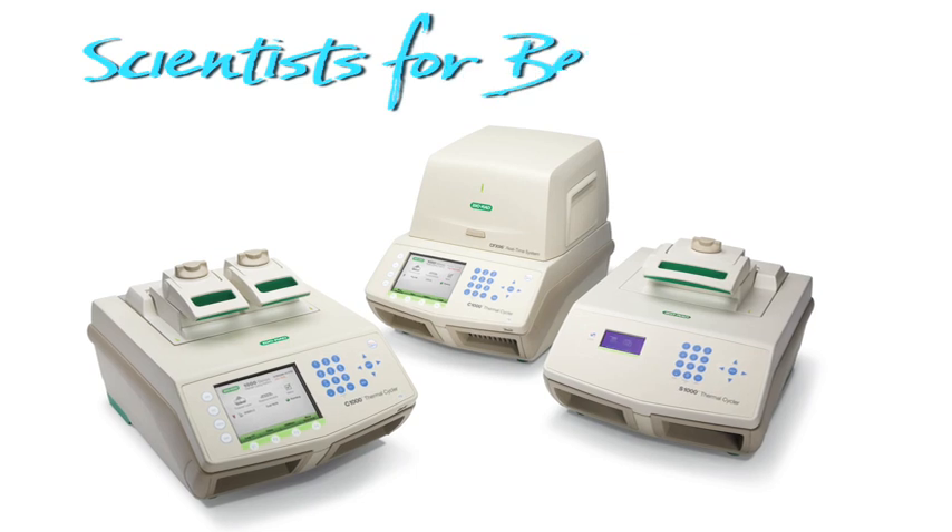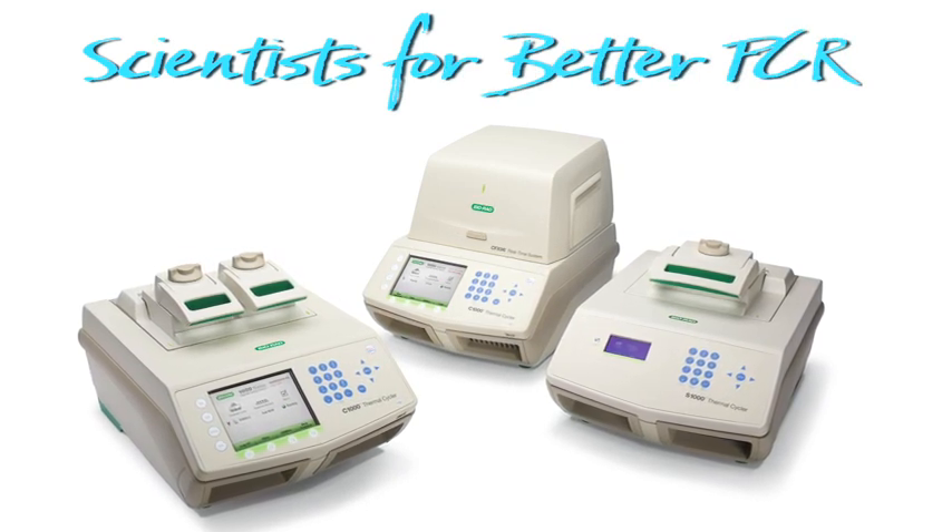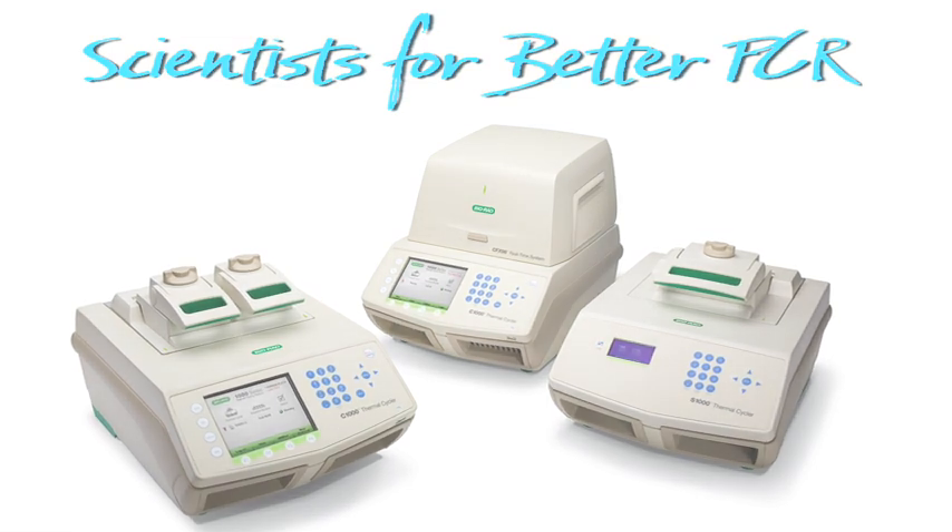PCR — to all the scientists out there doing PCR, Bio-Rad salutes you, with the all new 1000 series thermal cycling platform.